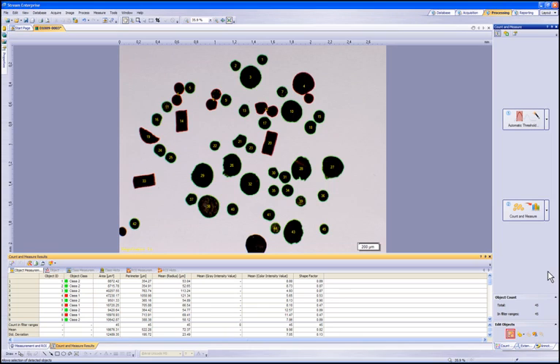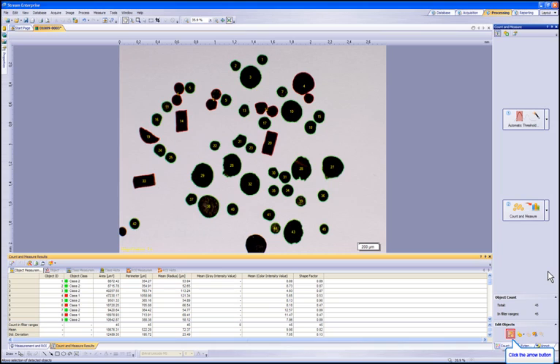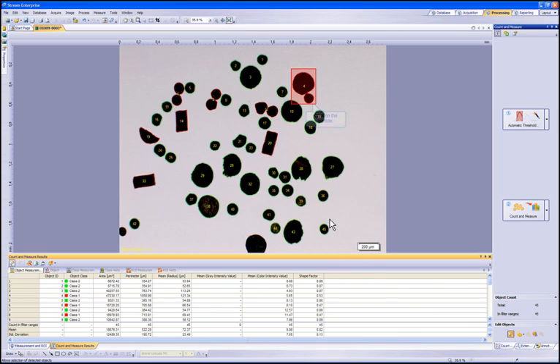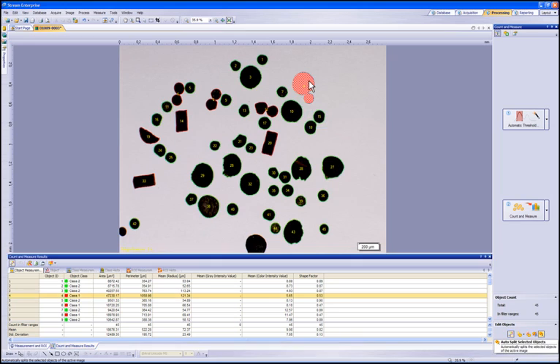Now we can see the detected particles on our sample. Since some particles were touching, we will need to perform particle separation to those ones. You will need to click on the Select Detected Objects arrow within the Count and Measure tool window. This will allow you to click on specific particles and highlight them to perform additional functions.